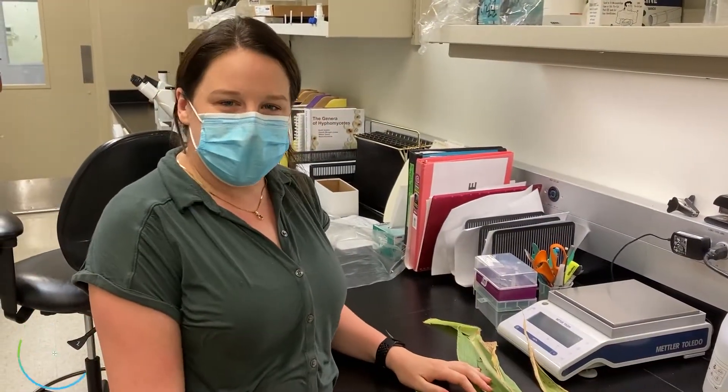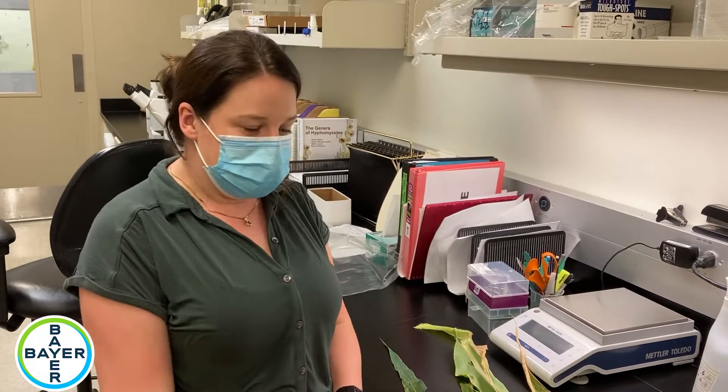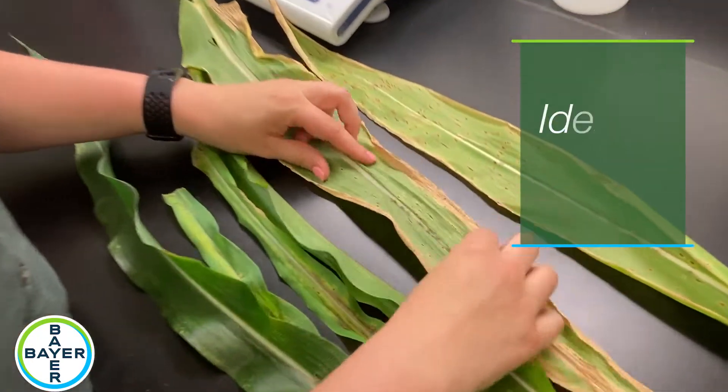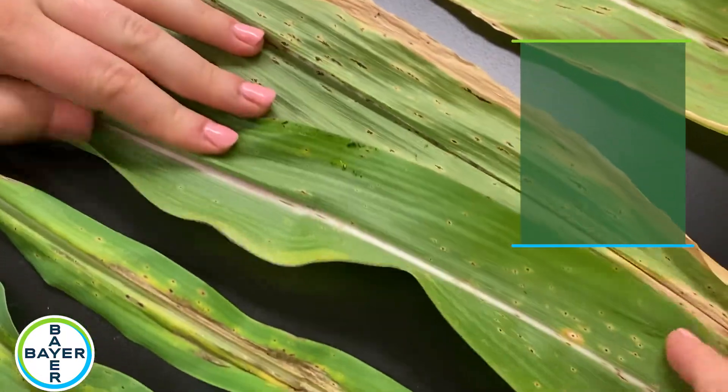We just received some samples here in Chesterfield of tar spot, or at least what we think is tar spot. We're going to have to check under the microscope, but I just took out the leaves and it looks like we have a lot of lesions here that appear on first glance to be tar spot.